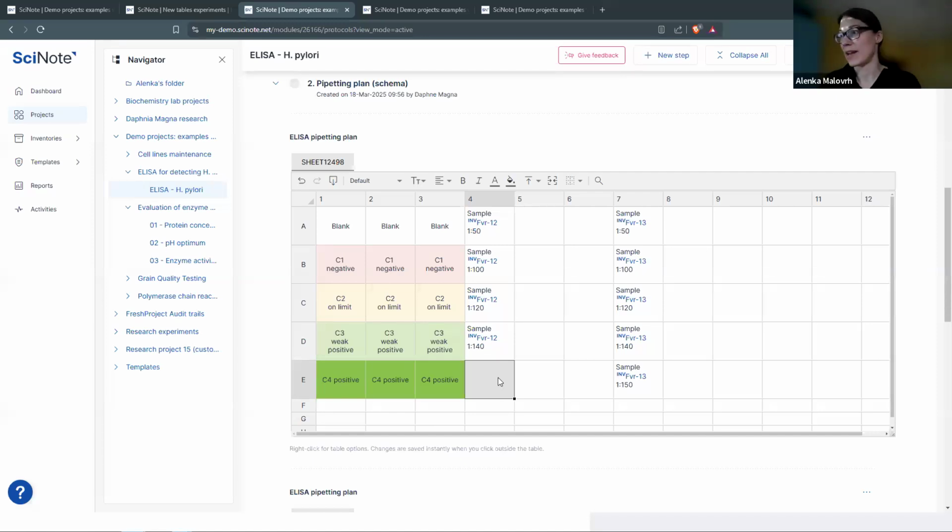And then I'll add the last one. So for the well plates, since you typically combine different information or you want to point out how many of each volume you combine in one well, we would advise that you enter your content in more lines using Alt or Option key plus enter in the cell content.